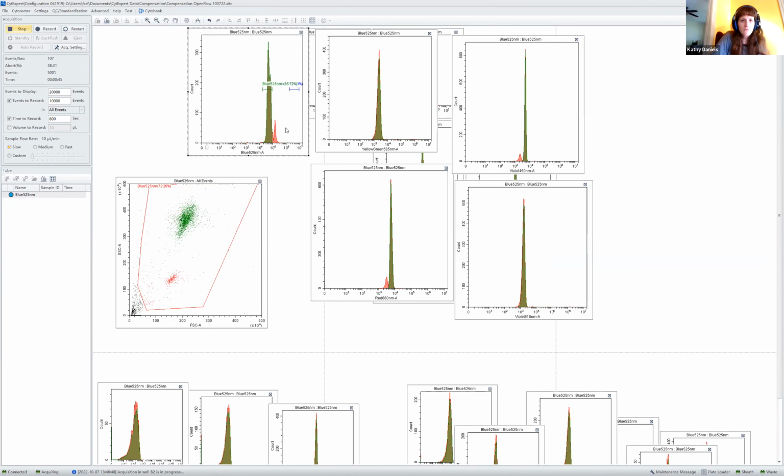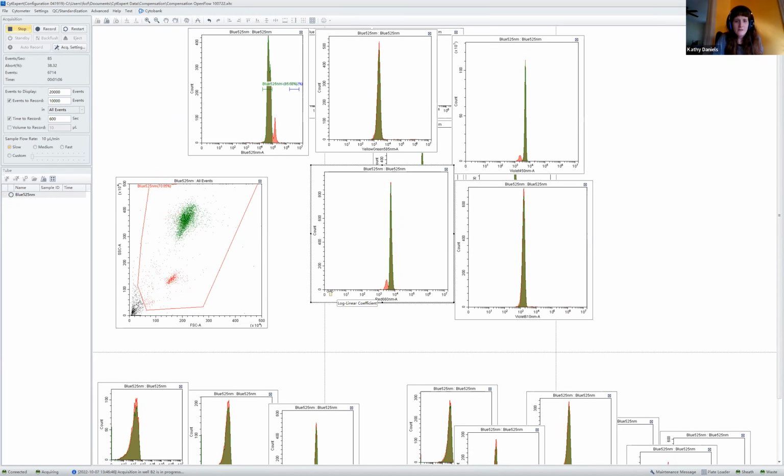Okay, so right now what I'm seeing, if I look at my FITC, my PE, my APC, my C-Fluor 420 rather, and my BB605, I'm seeing signal there. And what I want to do is adjust this little scale right there to see if I can adjust my linear log display. Okay. Oh, I went a little too far. Apologies. Okay, let's see if I can see that.